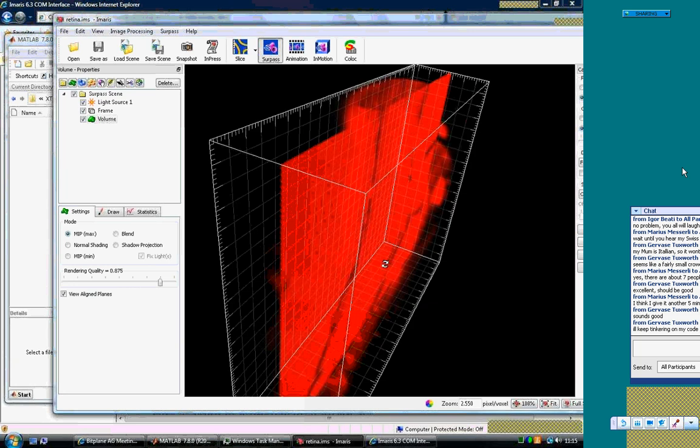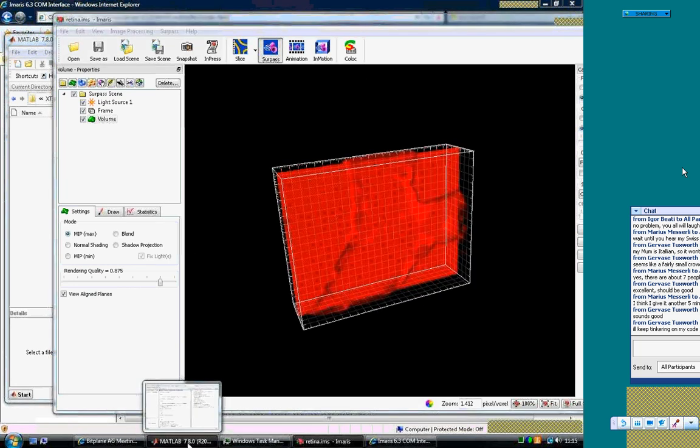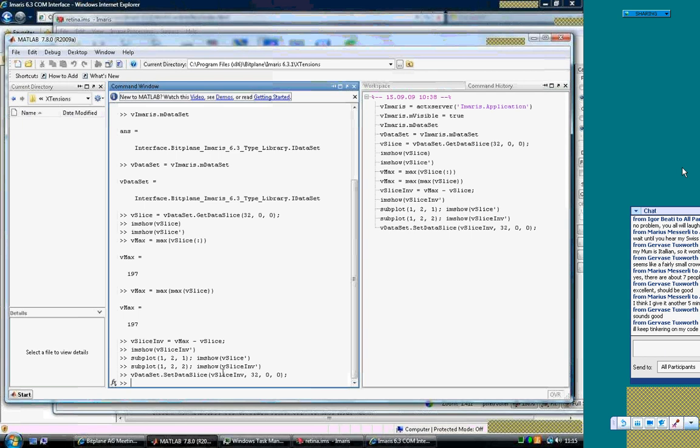So there are two ways to do this. You can transpose every time you get the values and work, and then transpose again before you set them, or you can keep it consistent, never transposing it. The same goes for the indices.